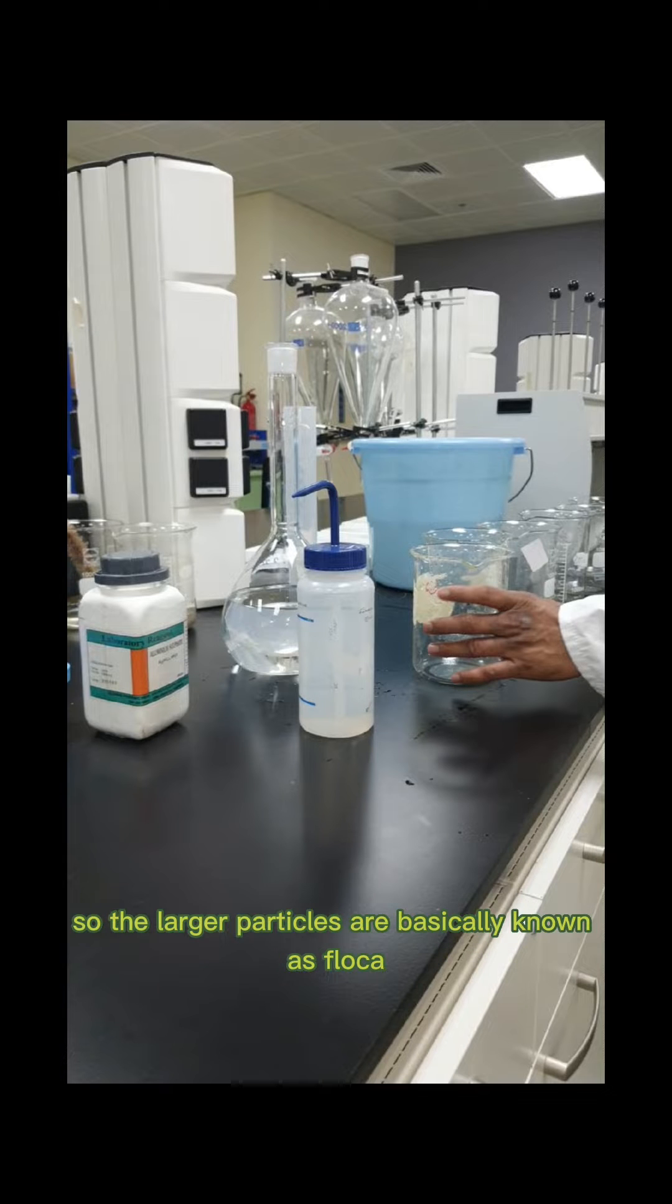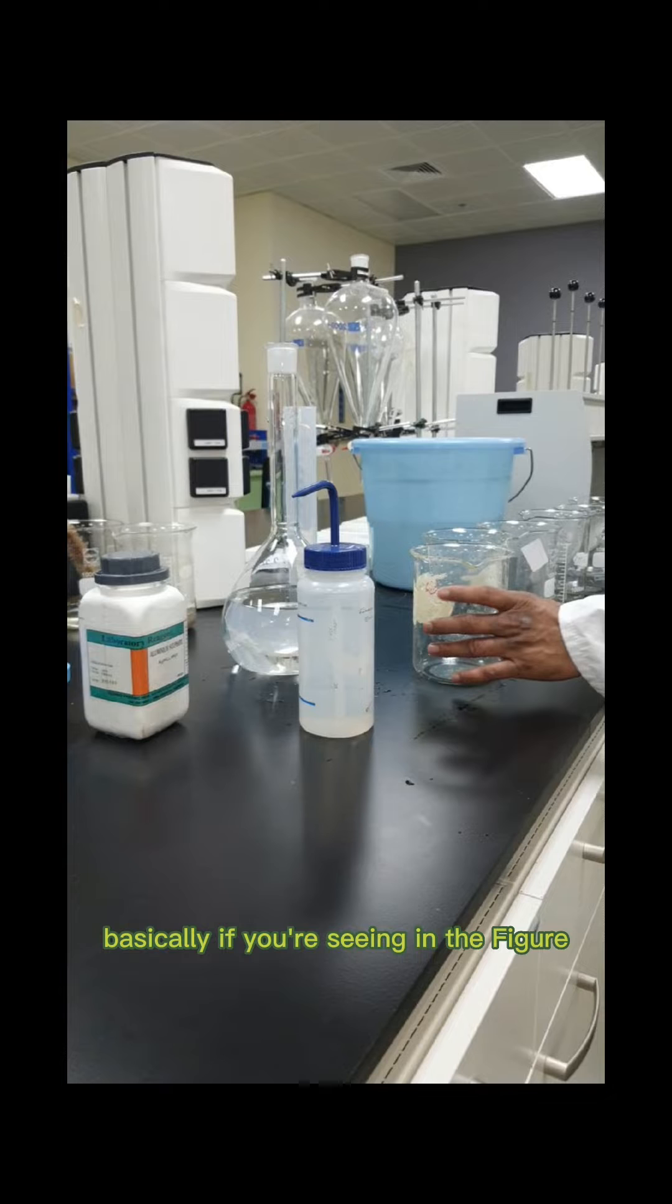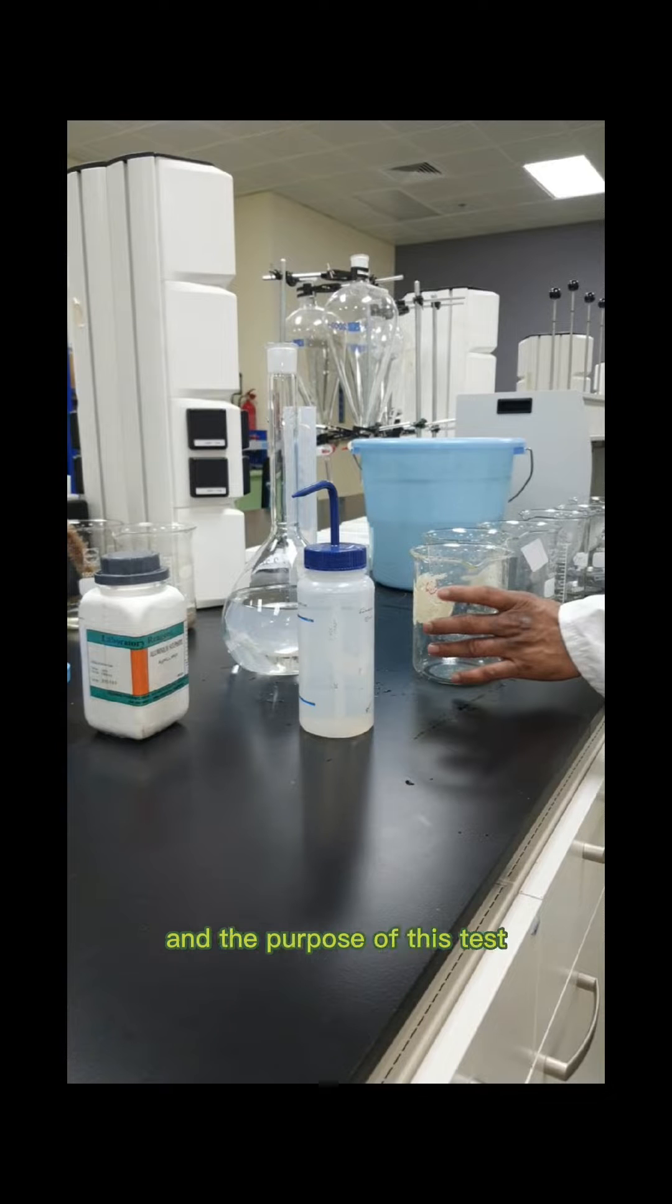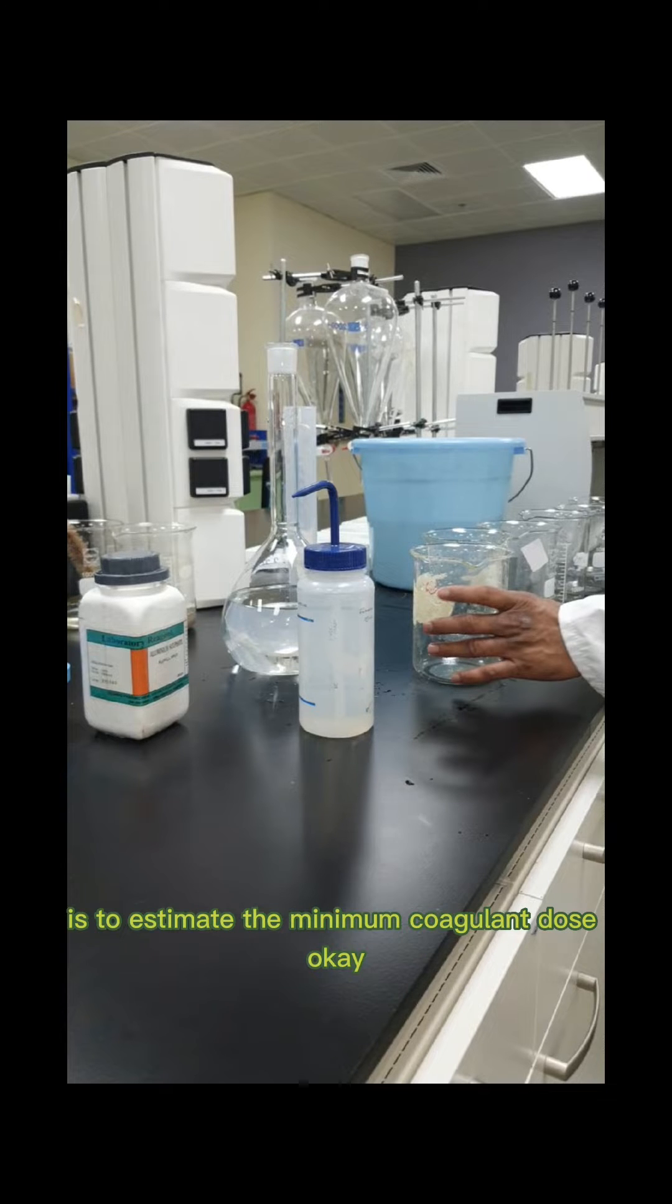The larger particles are basically known as flocs, and the jar test is a bench-scale laboratory test that simulates coagulation or flocculation with different chemical doses. In terms of chemical doses, we not only use aluminum sulfate; we have other coagulants in the market such as ferric chloride and ferric sulfate, and these coagulants are operative at different pH ranges.